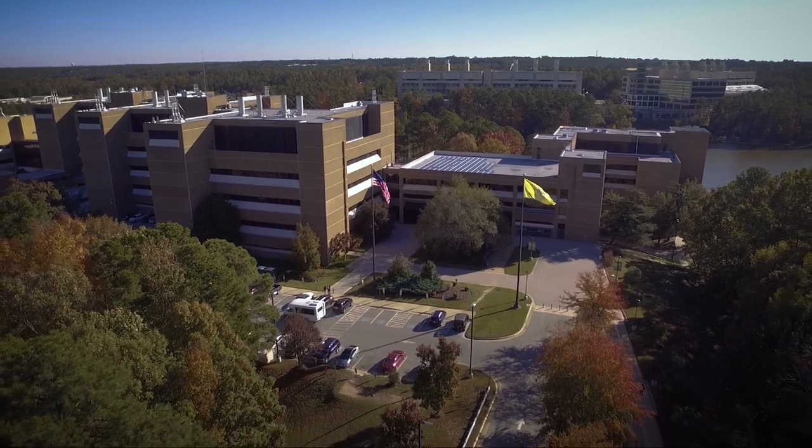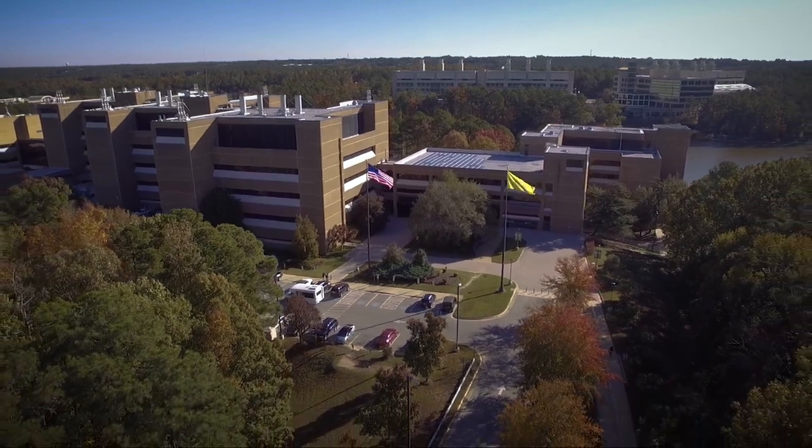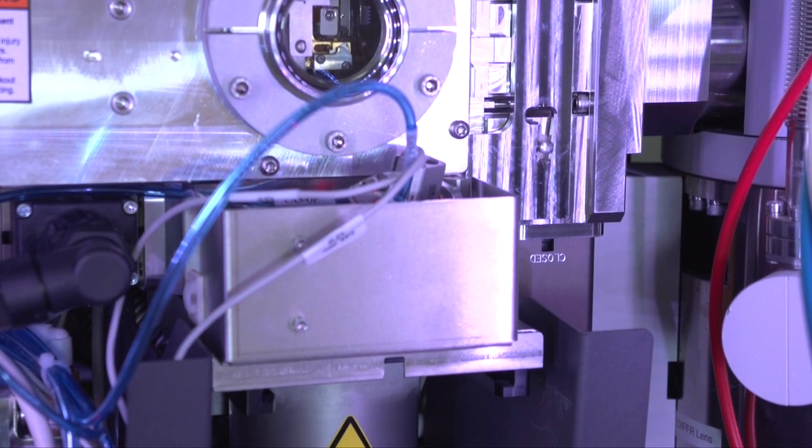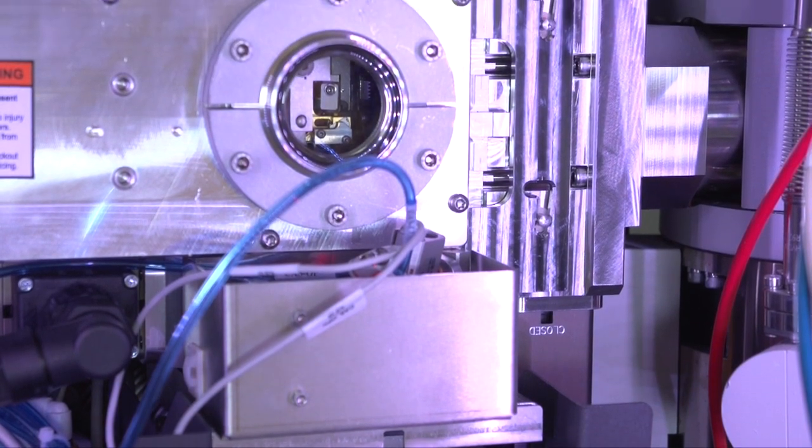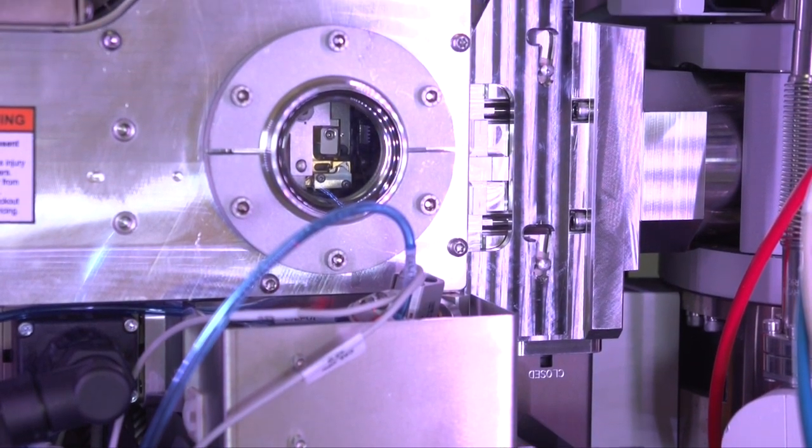The National Institute of Environmental Health Sciences is rapidly becoming a regional leader in cryo-electron microscopy, a Nobel Prize winning technology.